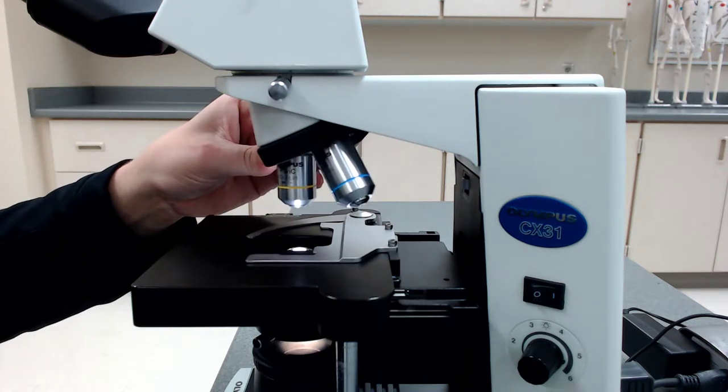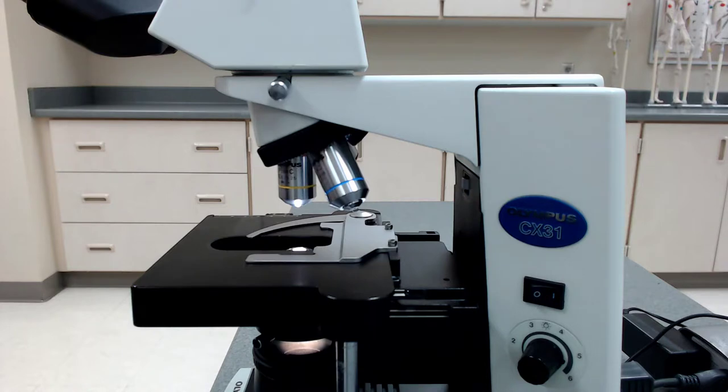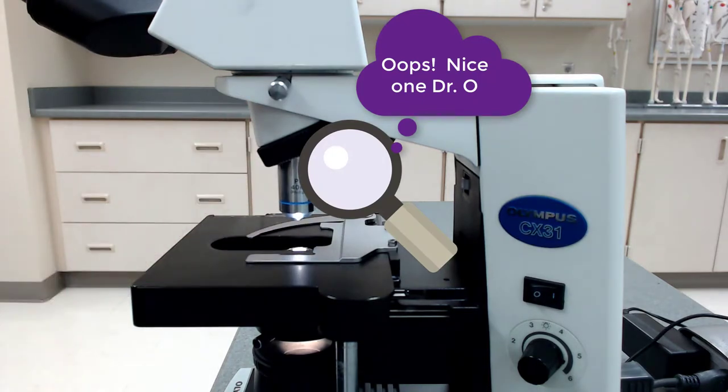Here we have the blue, 40x objective called high dry power. Highest power we can use without immersion oil, which is why it's called high dry power. And here we have the white, oh, we actually don't have an oil immersion objective on here.